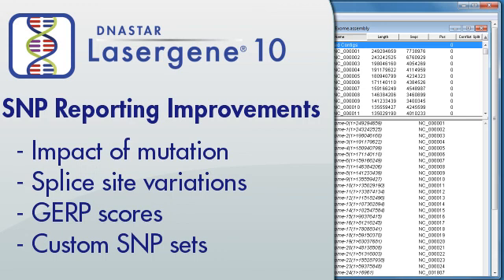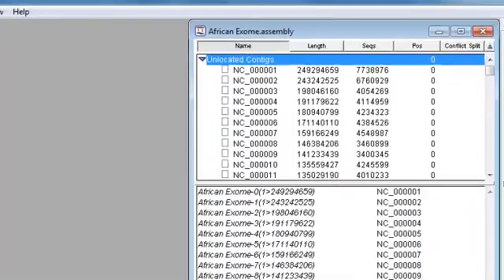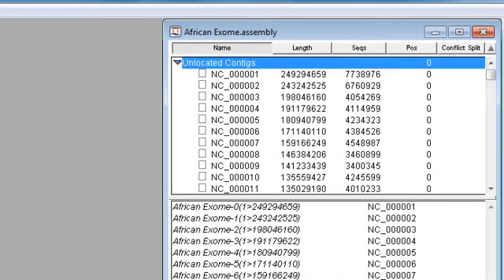LaserGene 10 includes several new enhancements for SNP reporting in SeqMan Pro. In this video, I'm going to show you what's new in the SNP report by looking at an exome assembly from SeqMan Engine.